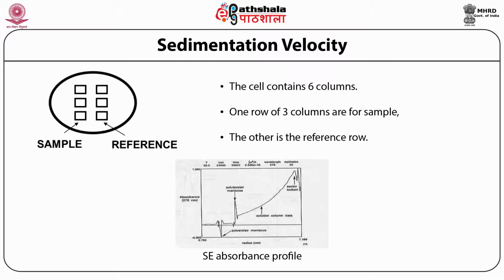Solute particles do not pellet at the bottom of the cell, but instead they undergo diffusion, which opposes the process of sedimentation until, after a period of time, the two opposing forces reach equilibrium and the apparent concentration profile does not change.